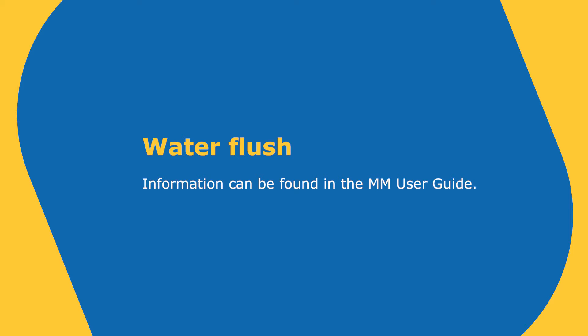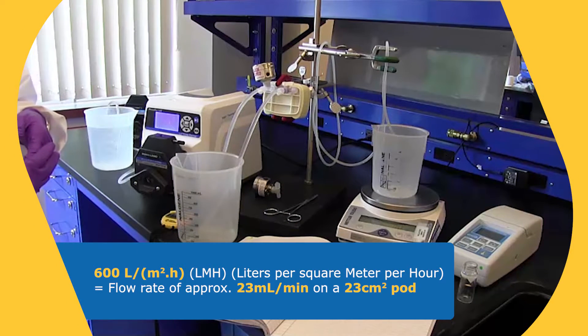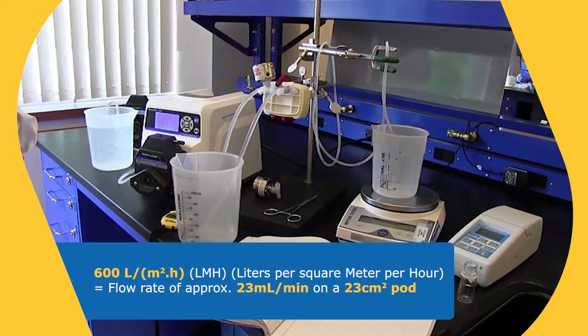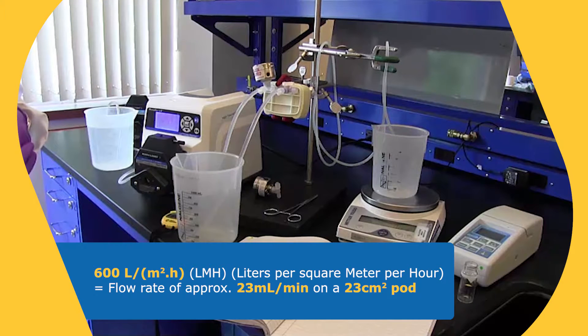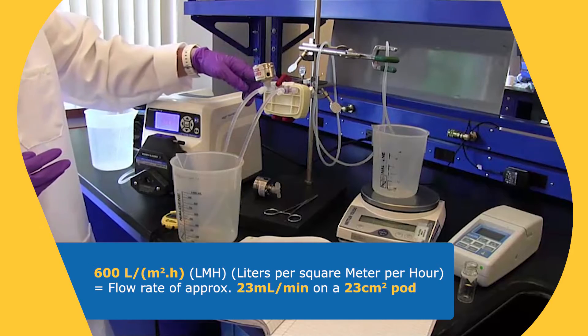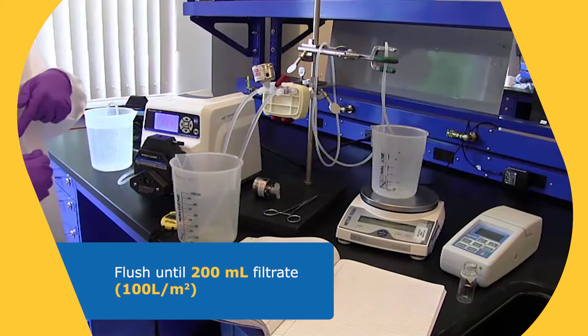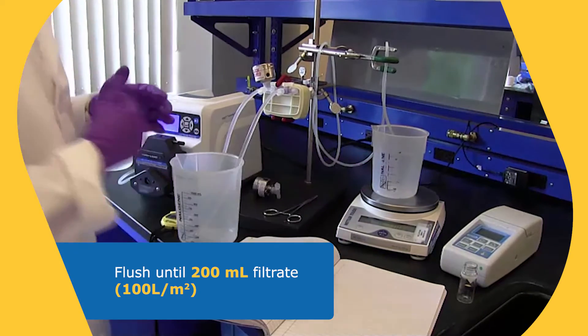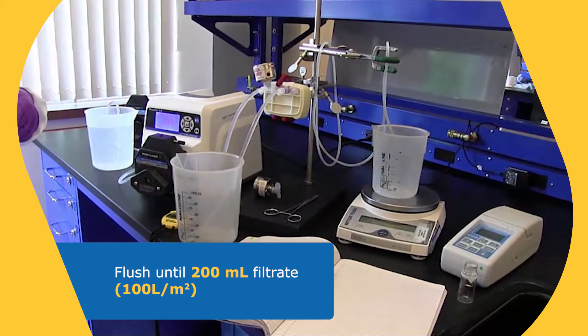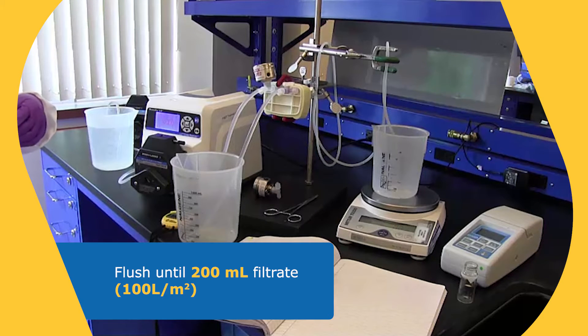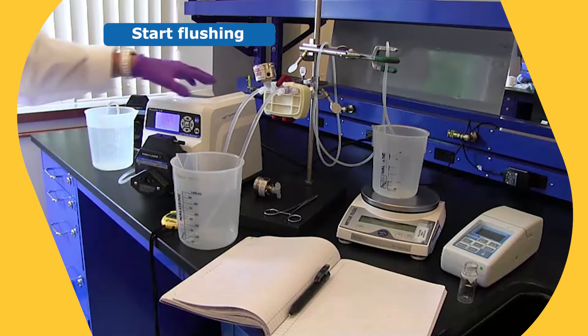So when we start, we're going to start with water flushing. So you can find this information in our user guide, which would be on our website, or you could contact our tech service or your account manager. And the specifications for flushing are 600 LMH. LMH is a flux term, and it's liters per meter squared per hour. So when you do the calculation to account for 23 square centimeters, your flow rate is approximately 23 mils per minute. And we're going to flush until we reach 200 milliliters in the bucket, and that's going to be equal to 100 liters per meter squared for a volume for loading.